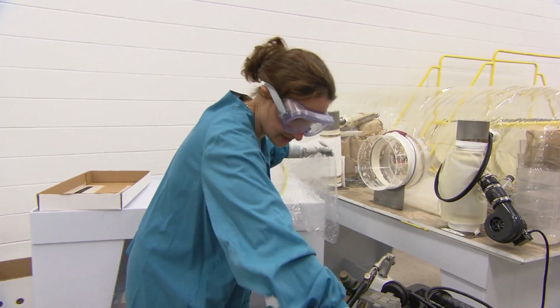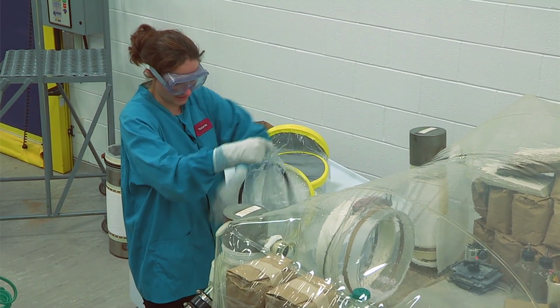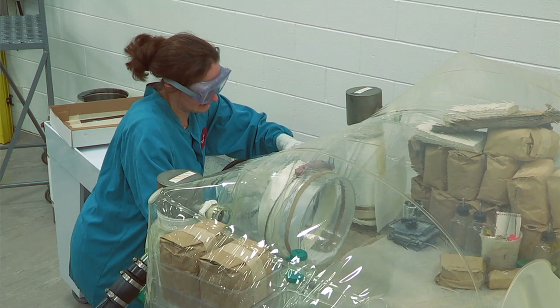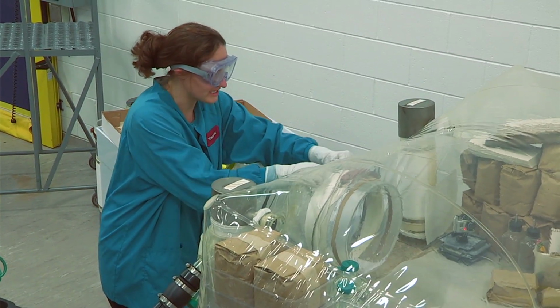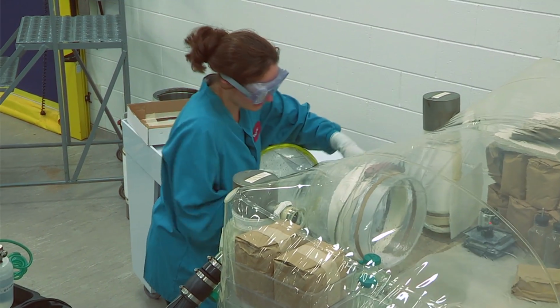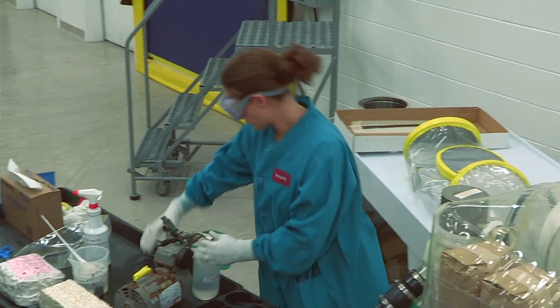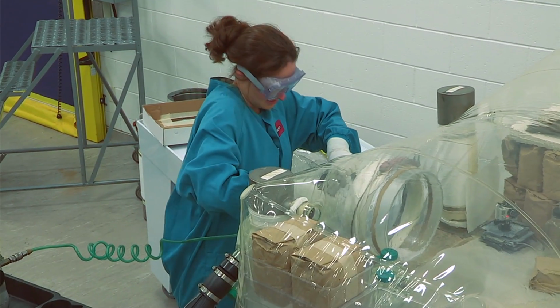Now this can be the difficult part because, let's get our band on here. Once we get this sleeve on, we need to fit that end of this atomizer into our sleeve, and sometimes it just doesn't want to go. We'll usually have technicians going through the building asking, can you help me with my cylinder? But usually it's just one. Okay, get this ready. So this is the difficult part. Trying to do this without losing your sleeve right off of the port. Take our atomizer here, and you have to lift up on your sleeve and get the top of your atomizer in here.